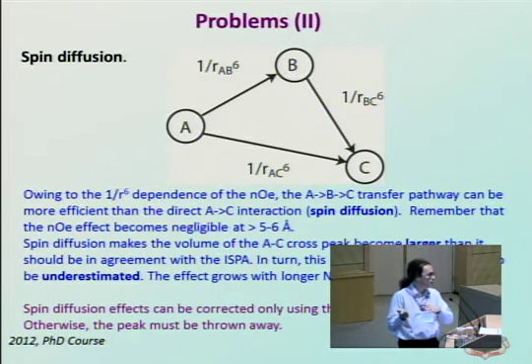And that goes exactly in the opposite direction to what you want, because you actually want to have larger distances, because you are saying that you will be satisfied if your atoms are closer than the threshold. So if you have a larger threshold, you just lose in resolution, but if you have a tighter threshold, that is the case here, you're actually getting problems because you are getting non-physical distances between atoms.